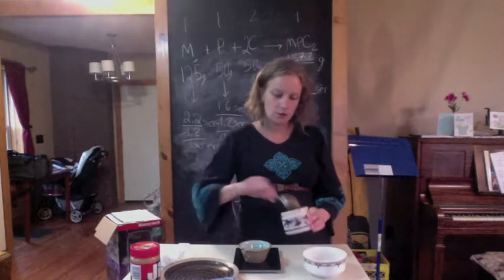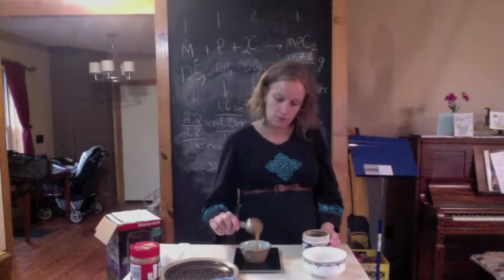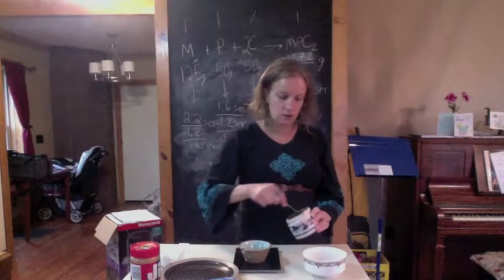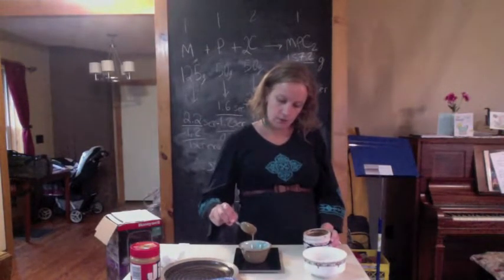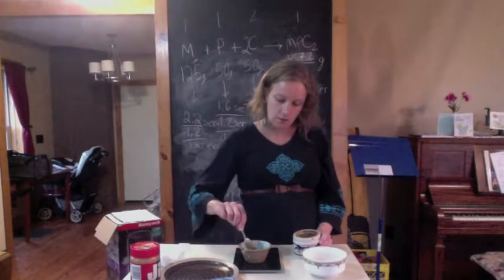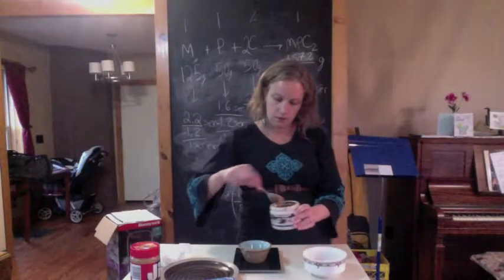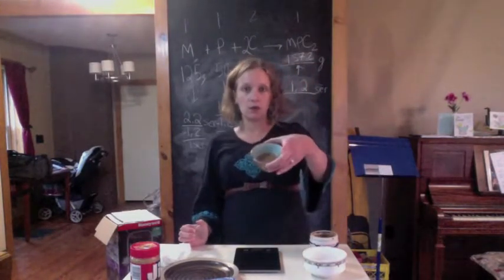It's 32, 45, 46, 50, 51 grams, 50 grams. Okay, we have 50 grams of maple cream here. So this is what we were given for our experiment.